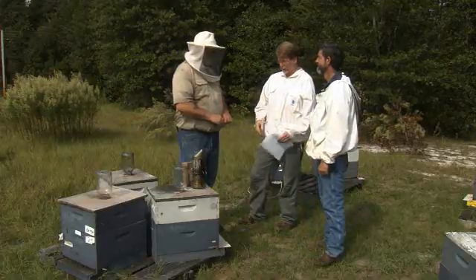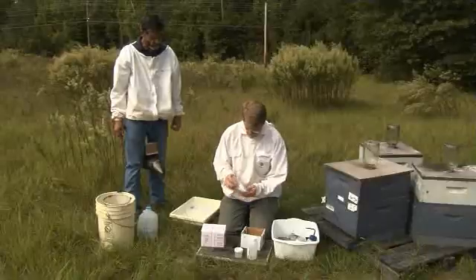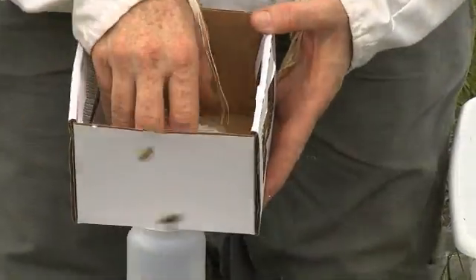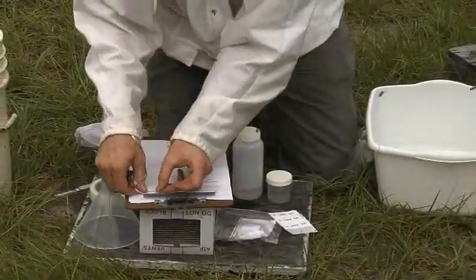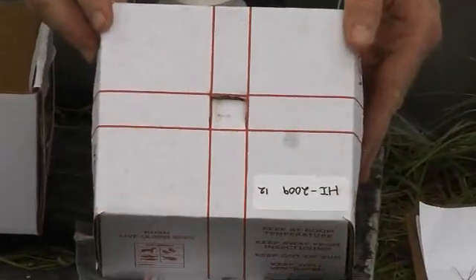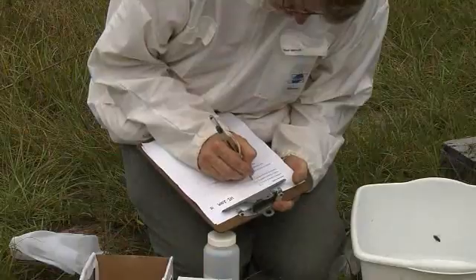Now you are ready to start sampling. Open one live bee mailing box. It should contain a Ziploc bag with one large bottle and one small bottle of alcohol. Another Ziploc bag contains a data collection sheet, ID stickers, mailing labels, stamp, and a nylon filter. You will find a petri dish glued to the bottom of the box that contains queen candy and a sponge. Place one ID sticker on the data identification sheet, another on the large collection bottle containing alcohol, one on the small collection bottle containing alcohol, and place the final ID sticker on the live bee shipping box.